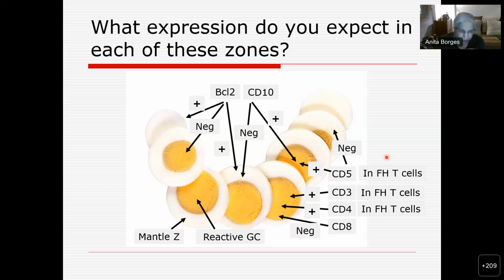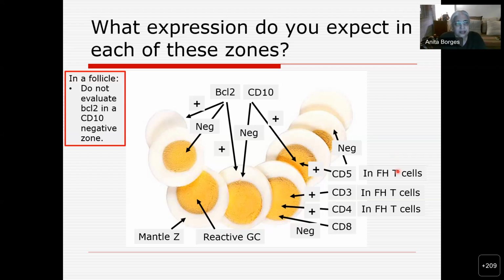Okay, so this was just a recapitulation of what I have just told you. You don't have to remember this, you have to understand it, okay? In a follicle, because now we're looking at a follicle, and what is a follicle? It has a mantle on the outside, and it has a germinal center in the center when it is reacting. All follicles are not reactive.